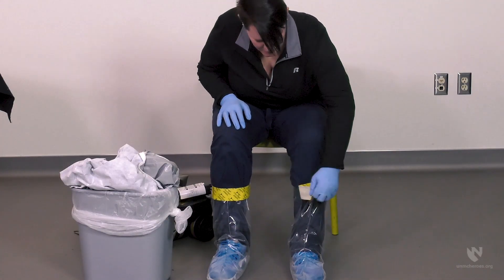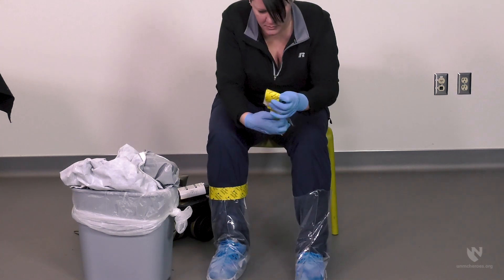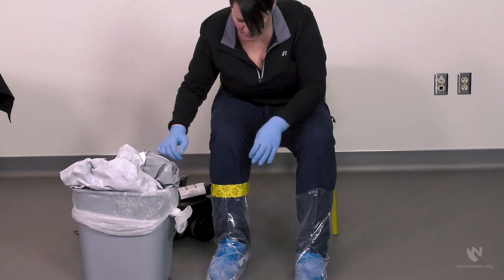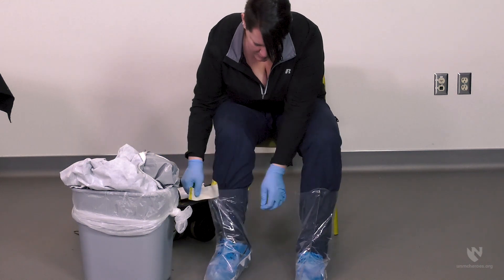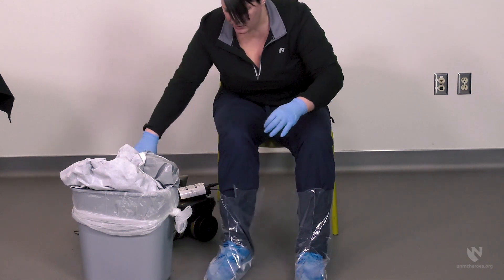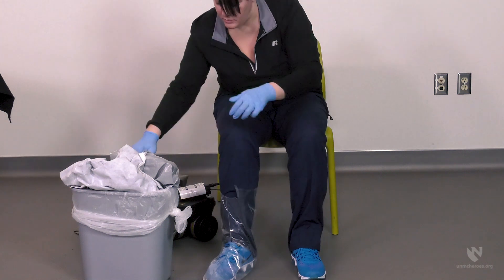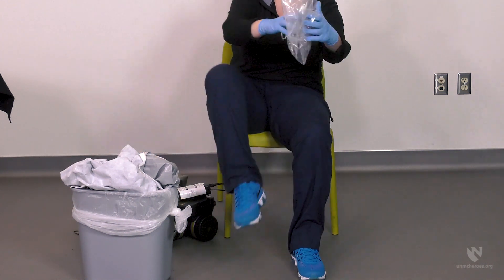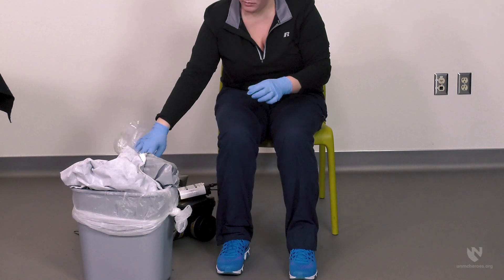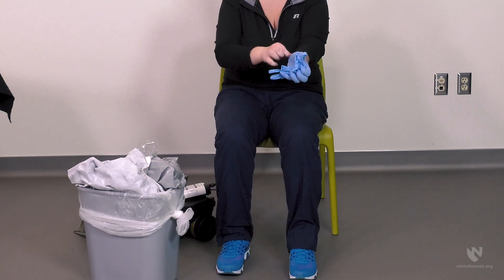Next, the tape that is securing the inner boot liners can be removed. With the tape removed, the boot liners can be taken off and placed in the trash. Finally, the inner gloves can be removed using glove-in-glove technique. The Decon team member should then wash their hands.